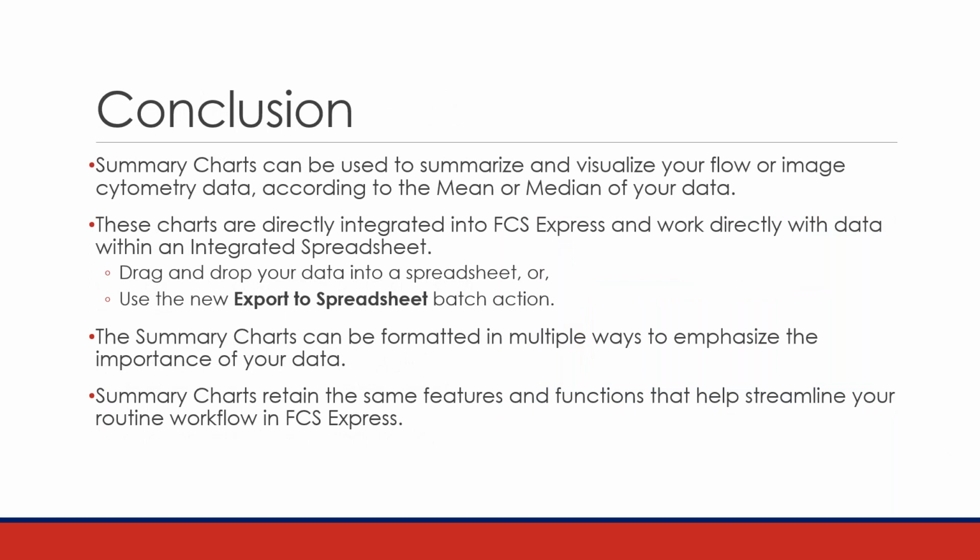Okay, that's pretty much all we have to show you today. So just to summarize, these summary charts can be used to summarize and visualize your flow or image cytometry data according to the mean or median of your data. And as I mentioned, these charts are directly integrated into FCS Express and they work directly with data through an integrated spreadsheet. However you want to populate that spreadsheet in FCS Express, that's up to you.